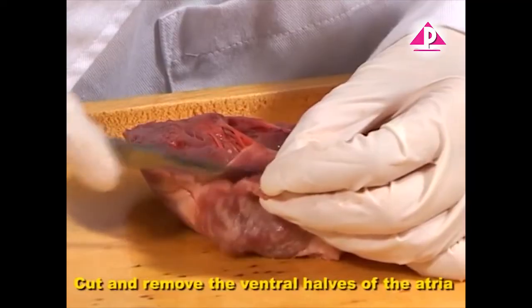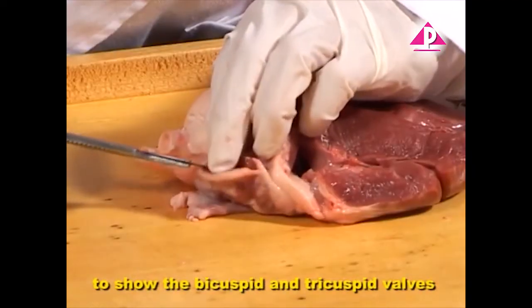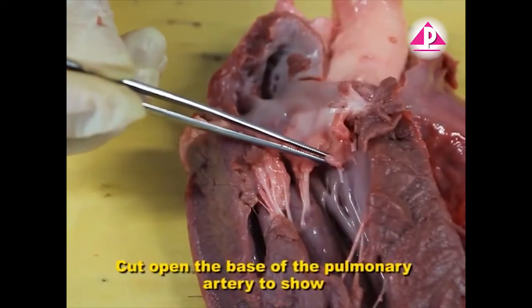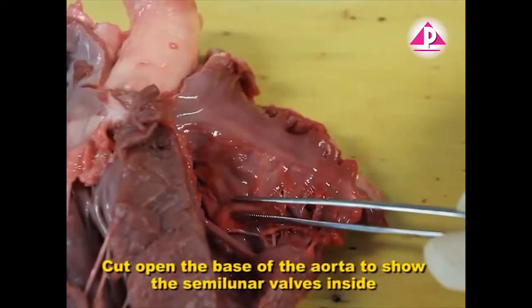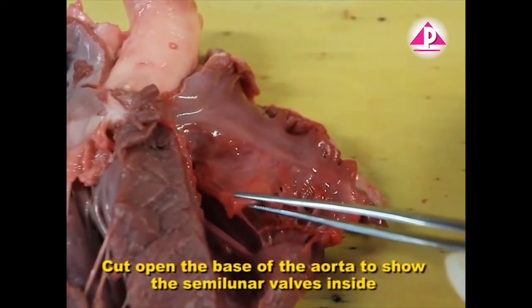Cut and remove the ventral halves of the atria to show the bicuspid and tricuspid valves. Cut open the base of the pulmonary artery to show the semilunar valves inside. Cut open the base of the aorta to show the semilunar valves inside.